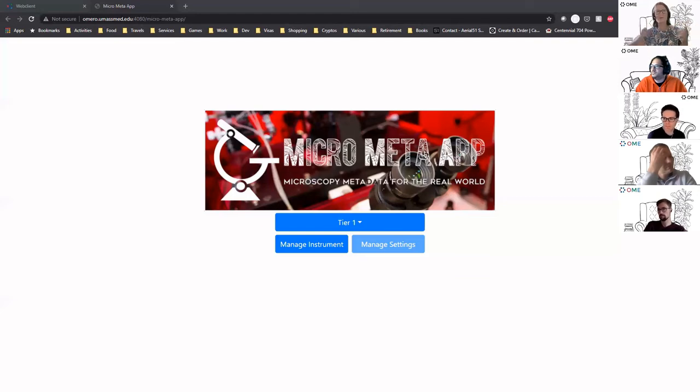If, for example, you were interested in setting up a database of all the facilities in the United States and all the different instruments they had, and they had used this system to input their information, you mentioned JSON files, could those files be accessed so that you could build a database of all the instruments in a particular continent or something like that?